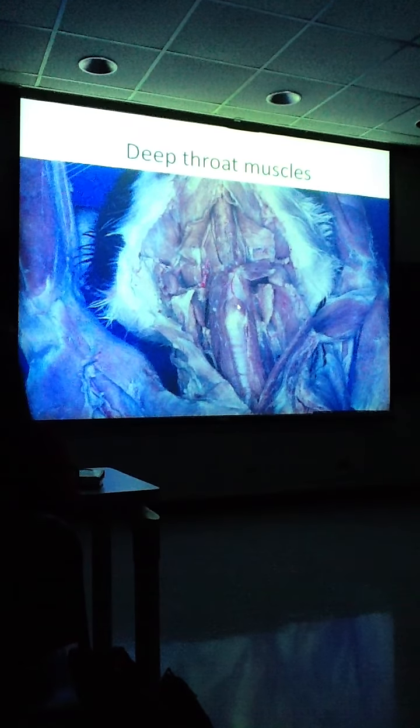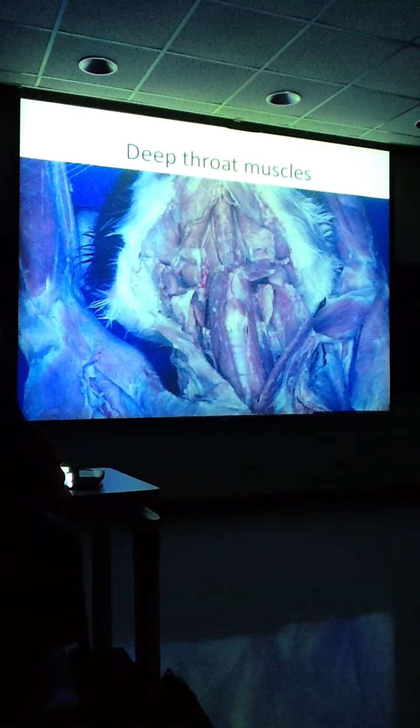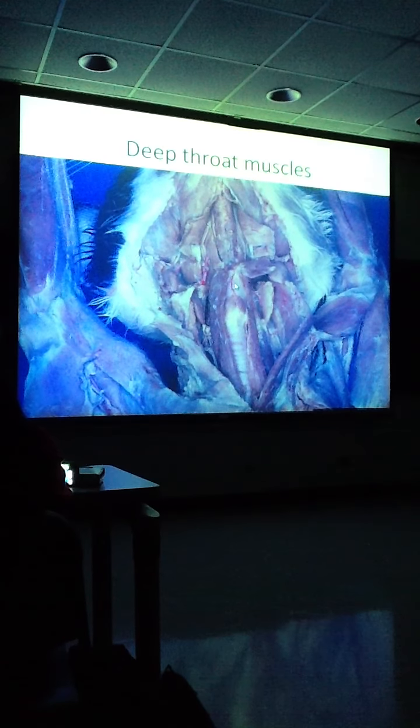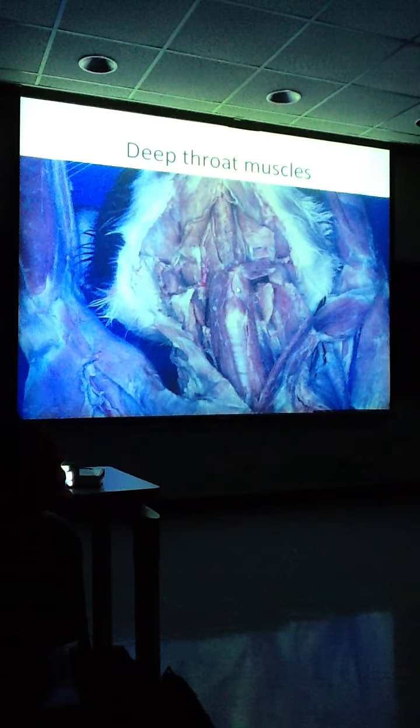That's cricothyroid. What is this little slinky-like thing right here that has 20 cartilaginous rings? His name is trachea. Remember, if this is the trachea, what's right above it, Mr. Gilmore? The larynx. That's the vocal bar. That's why I make my sound, Mr. Gilmore. All right, it sounds good.